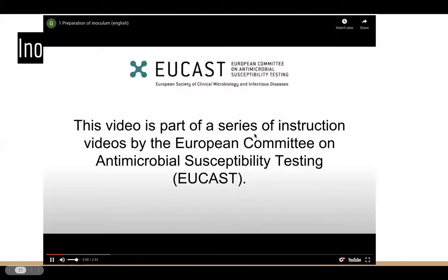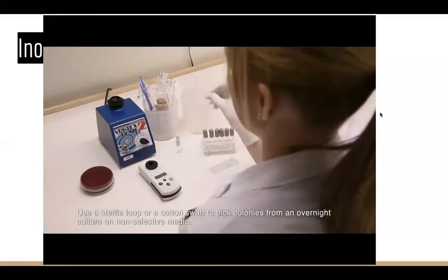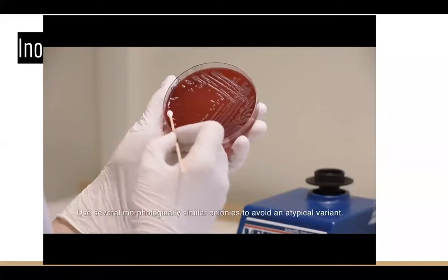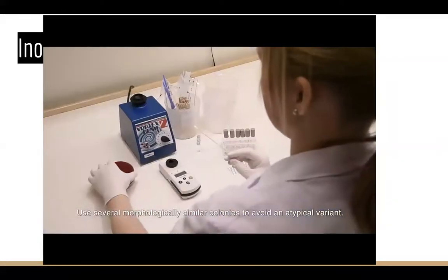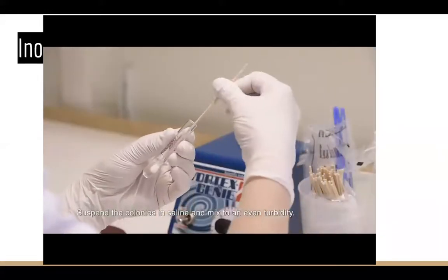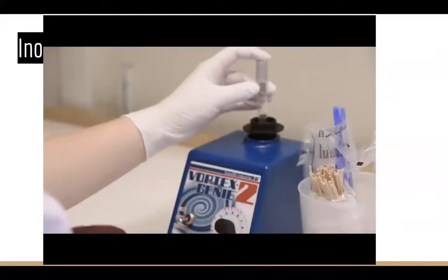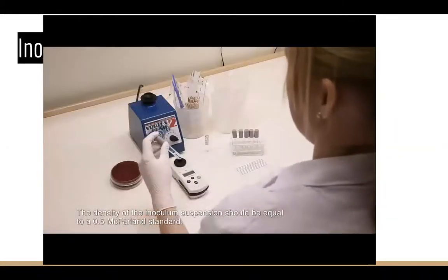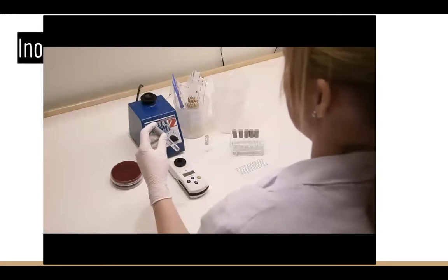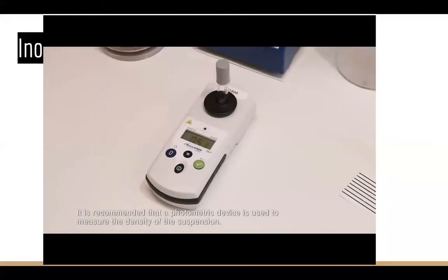This is by EUCAST, the European Committee. Use a sterile loop or a cotton swab to pick colonies from an overnight culture on non-selective media. Use several morphologically similar colonies to avoid an atypical variant. Suspend the colonies in saline and mix to an even turbidity. The density of the inoculum suspension should be equal to 0.5 McFarland standard. It is recommended that a photometric device is used to measure the density of the suspension.